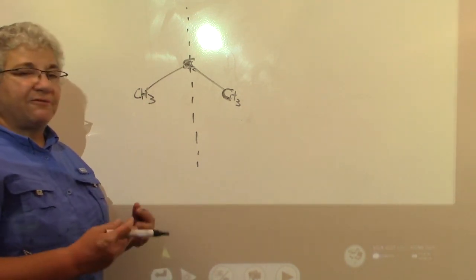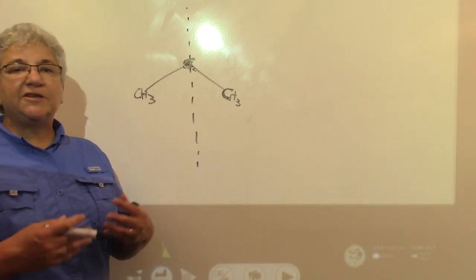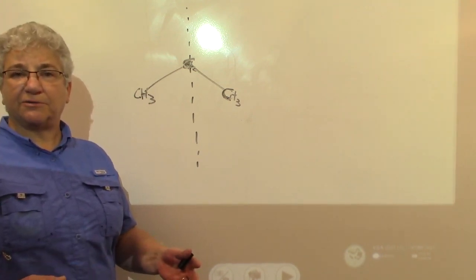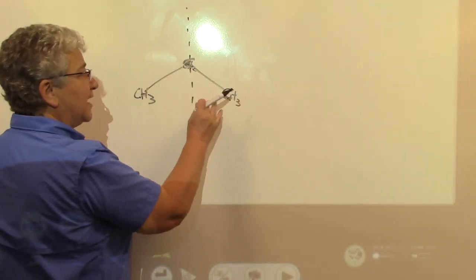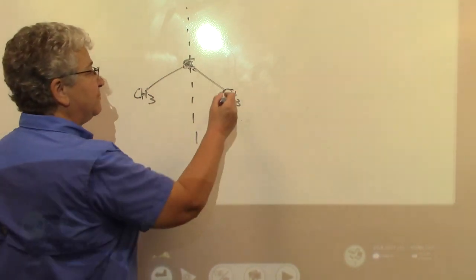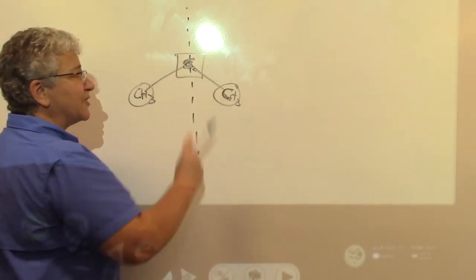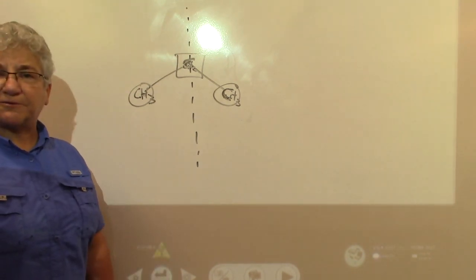So the number of peaks that you see in your spectrum often indicates whether there is symmetry or not in your molecule, and we use that when we're building molecules. And so for propane, I'm only going to see 2 peaks in the spectrum because that's the same as that, and that one is different. And so I'm going to see 2 frequencies that are absorbed, and in fact, that is what you see on your spectrum.